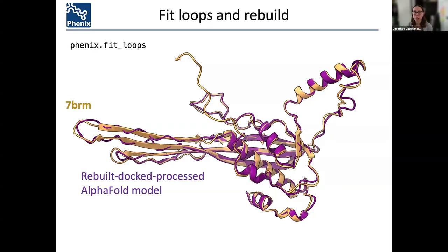Okay. Well, if it is saving, if we're talking about the Phenix ChimeraX, in ChimeraX you can then just save the new position of the model. You go to File and you ask it to save that model that has been placed. Now, if you are in the Phenix GUI, an output of all these docking procedures is the docked model, so that will fit the map. Oh, you pinpoint a location in Chimera where to dock your model. How do you pick the location? Well, in this case, if you do it visually, you would already have an idea where to place it.